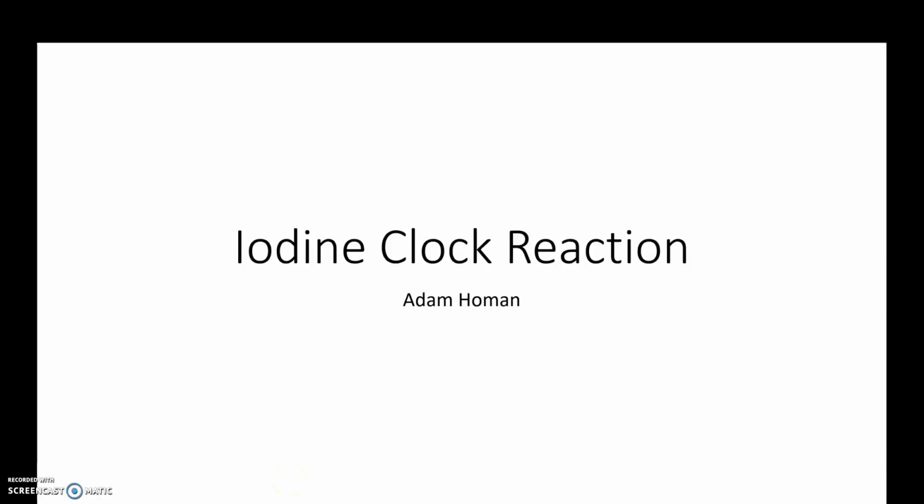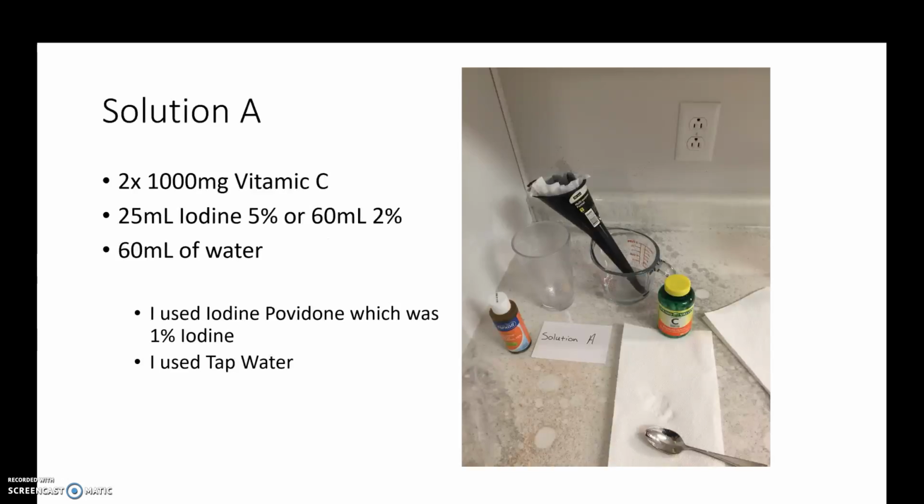Hi everyone, this is Adam Holman doing the Week 2 Interactive Advanced Concept, the iodine clock reaction. So basically this experiment deals with solution A and solution B, mixing those solutions together and seeing the reaction.